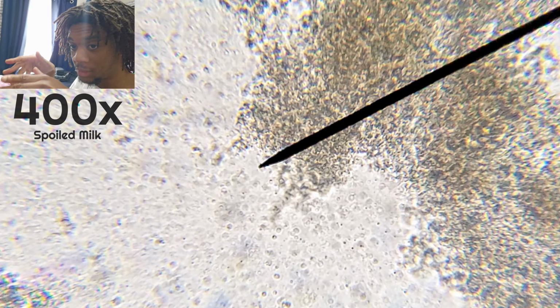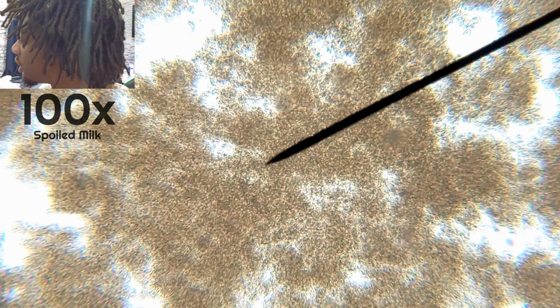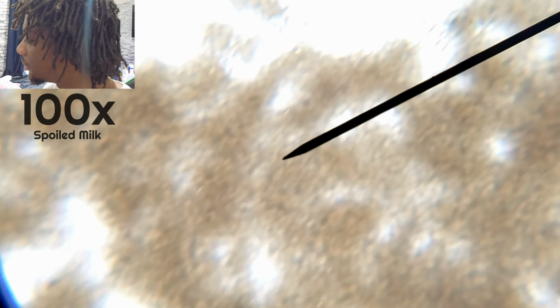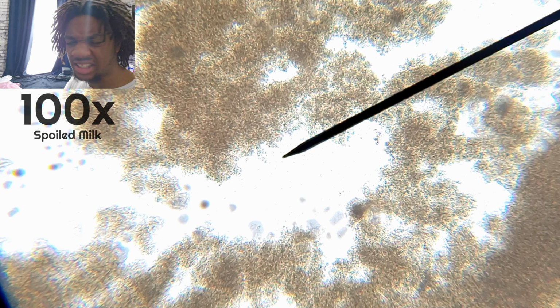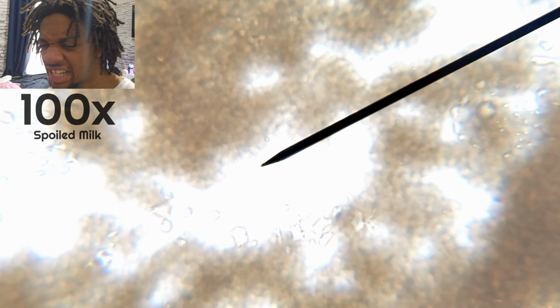It's hard, because right now I'm looking through my phone. That's what I'm doing. See? That's how I'm looking through it. I'm not looking right into the eye part. I'm looking through the phone, and so there's just a lot of curd. I'm pretty sure. I think that's curd. Curd and bacteria, that's probably mostly within this. Unless those are fat clumps. Isn't that kind of the same thing? I'm not familiar with milk anatomy like that.